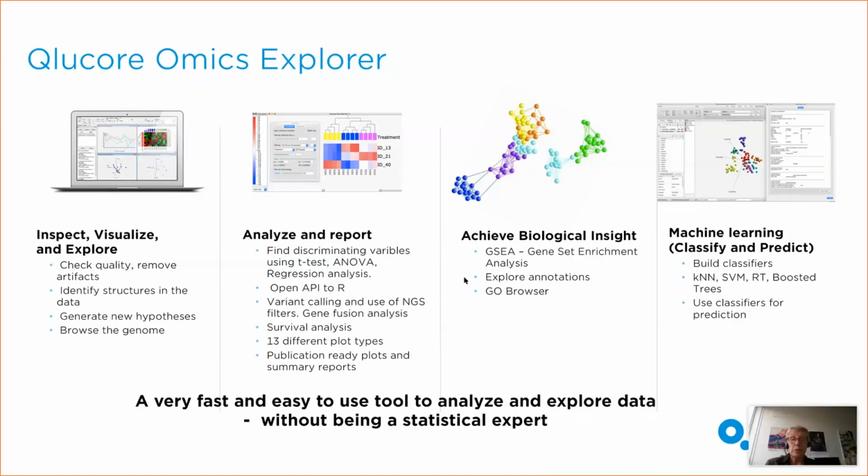Today we are going to concentrate on this functionality to identify interesting genes relevant for the tumor infiltration that we're interested in, and then present those genes in a couple of different plot types, and finally export them to MetaCore for further exploration of the underlying biology. So that's the plan. And now a brief introduction to MetaCore, which the slide comes here.